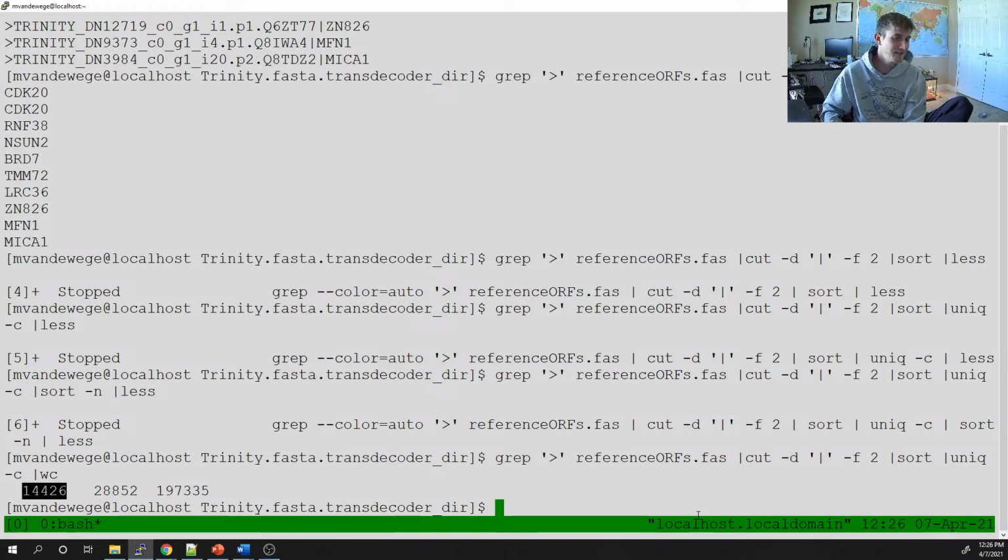And that's consistent with what I typically see in a mammalian transcriptome, somewhere between 8 to 14,000, usually not more than 15, but it probably comes out to an average of about 10,000. And we also have to recognize this is testis. Testis is doing all kinds of crazy things. It's going through mitosis at the same time it's going through meiosis. Its sperm are maturing. Sperm do a lot of weird things.